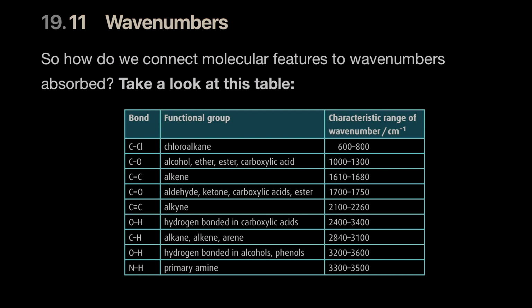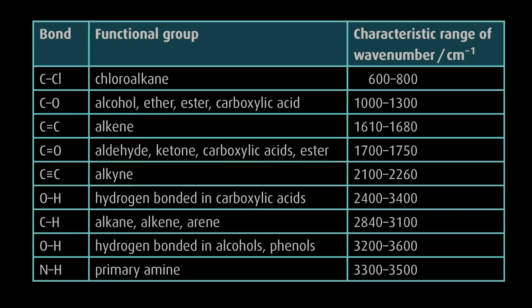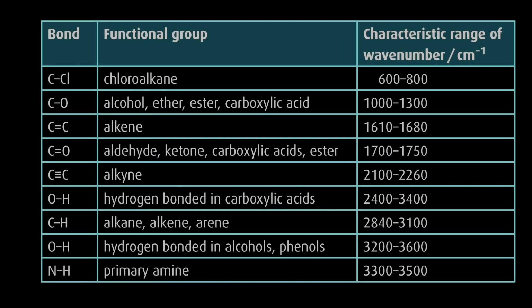But some of the more important ones, I'm going to zoom in. First of all, look at this table. You will realize that you can look inside the fingerprint region for something also. Like if you remember, the CO bond is present in esters, in acids, and in alcohols.